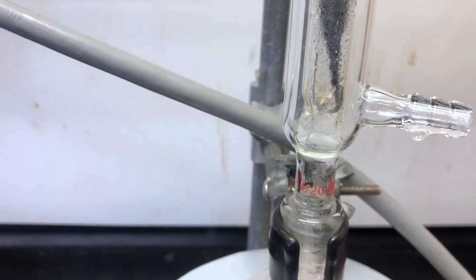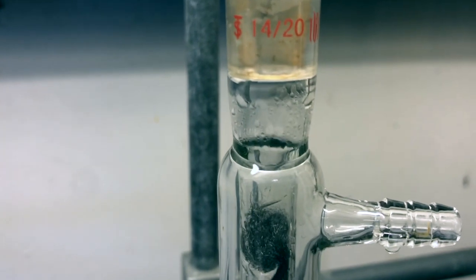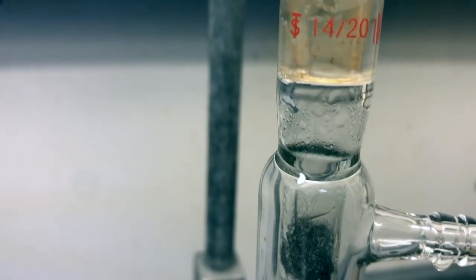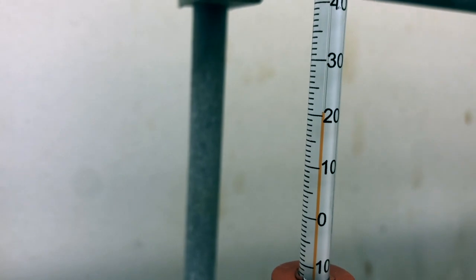Each time vaporization and condensation takes place, that is called a theoretical plate. The longer the fractionating column, the more theoretical plates we will have. At this point the vapors have almost reached the thermometer, but not quite. You can see refluxing where the vapors are dropping back down, and the temperature is still reading near room temperature.